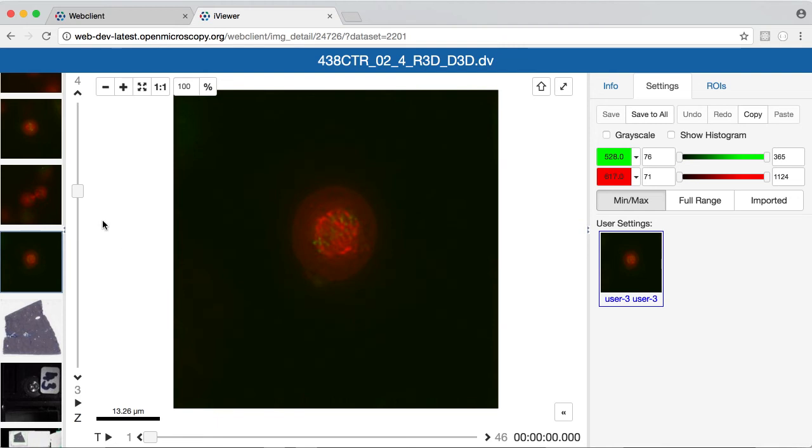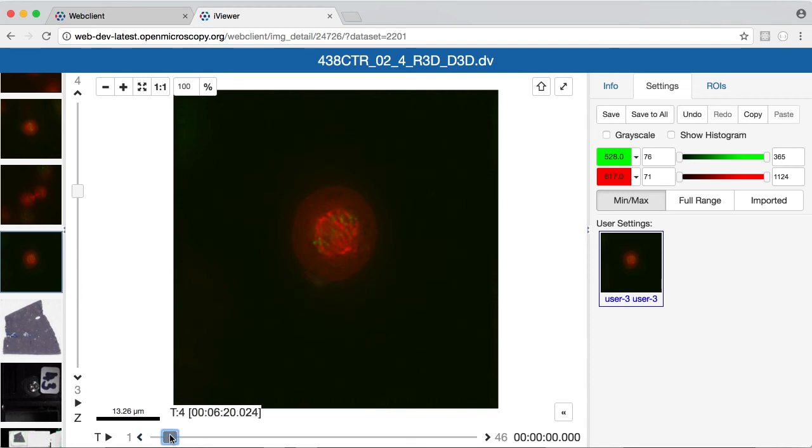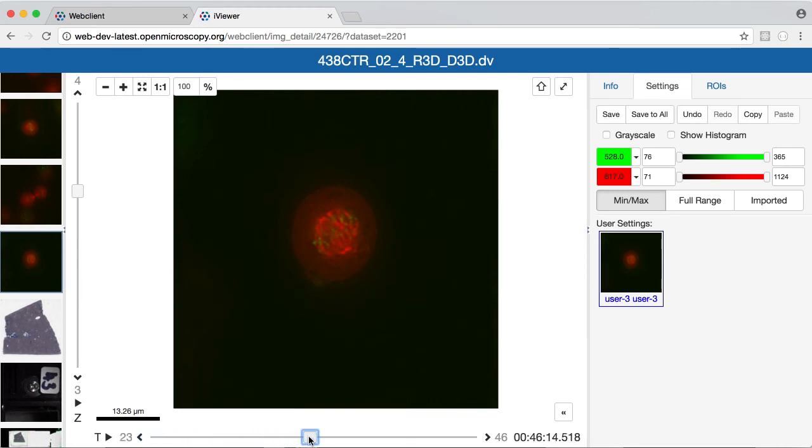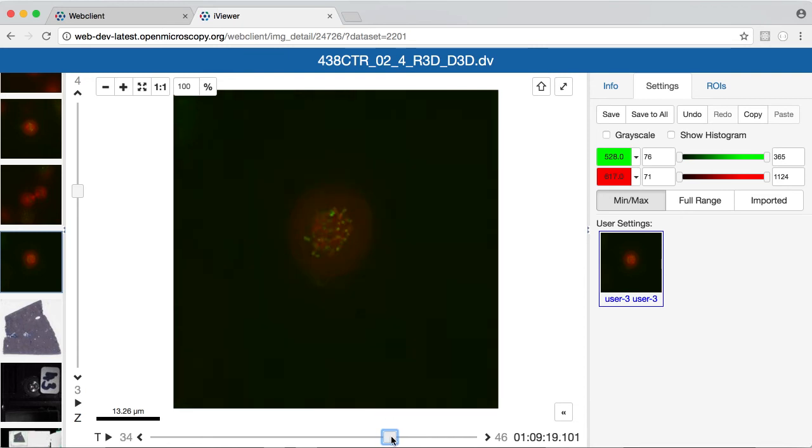This is an image that has multiple z-sections, so I can use both sliders for z and time points, and you'll see the timestamp information for this movie is shown at the bottom.